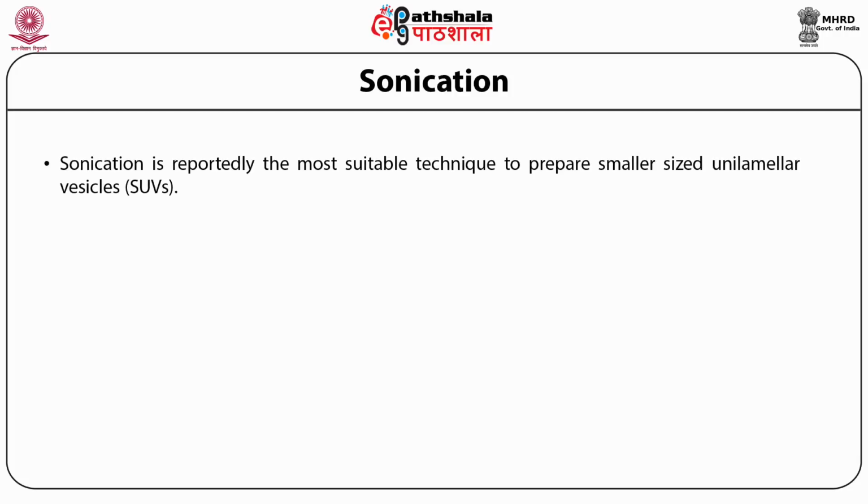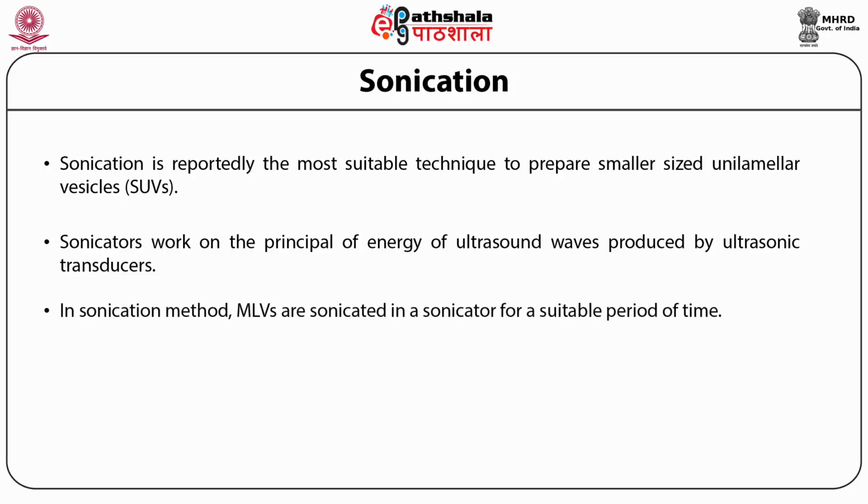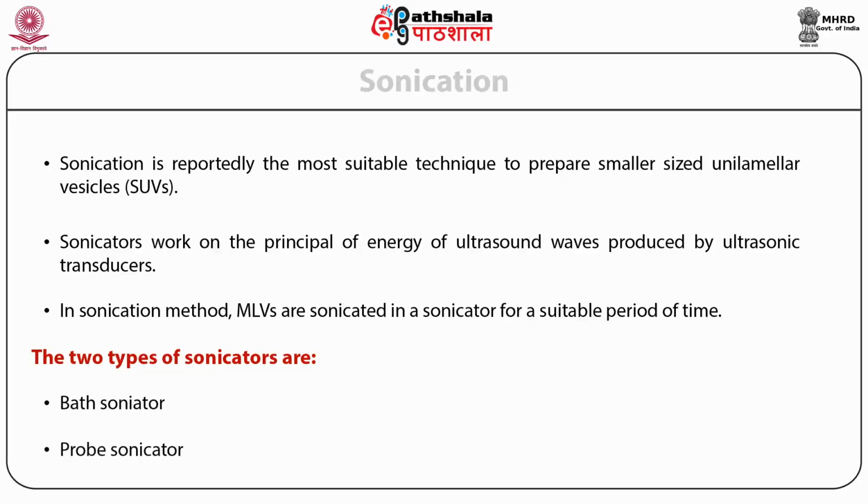Sonication is reportedly the most suitable technique to prepare smaller sized unilamellar vesicles. Sonicators work on the principle of energy of ultrasound waves produced by ultrasonic transducers. In the sonication method, multilamellar vesicles are sonicated in a sonicator for a suitable period of time. The two types of sonicators are bath sonicator and probe sonicator.